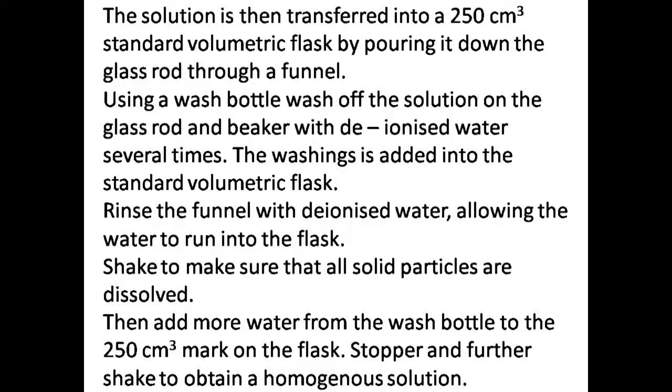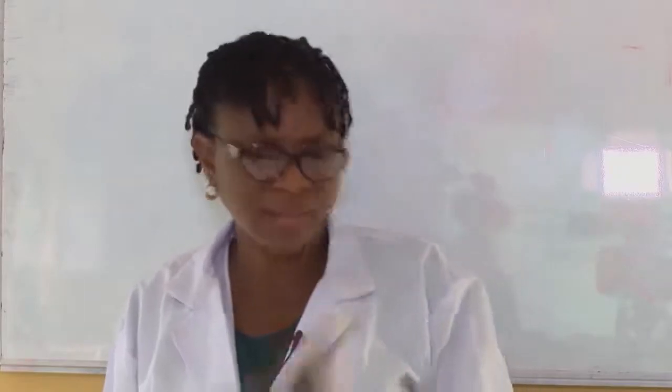Shake to make sure that all solid particles are dissolved. Then add more water from the wash bottle to the 250 cm³ mark on the flask. Stopper and shake further to obtain a homogeneous solution. In that way, you have prepared your standard solution of 1 molar sodium carbonate.